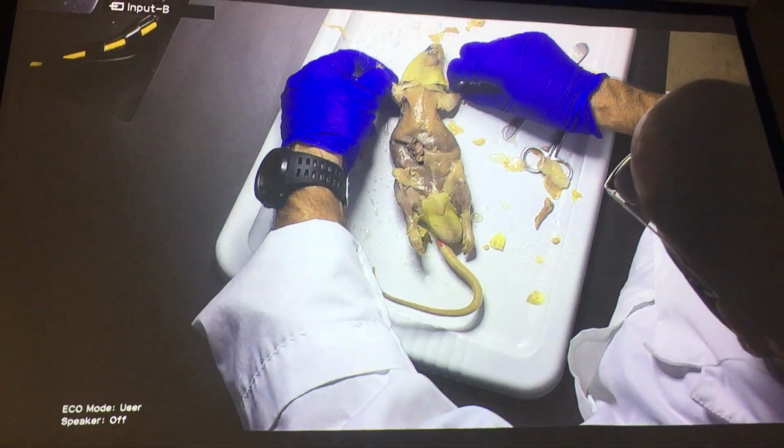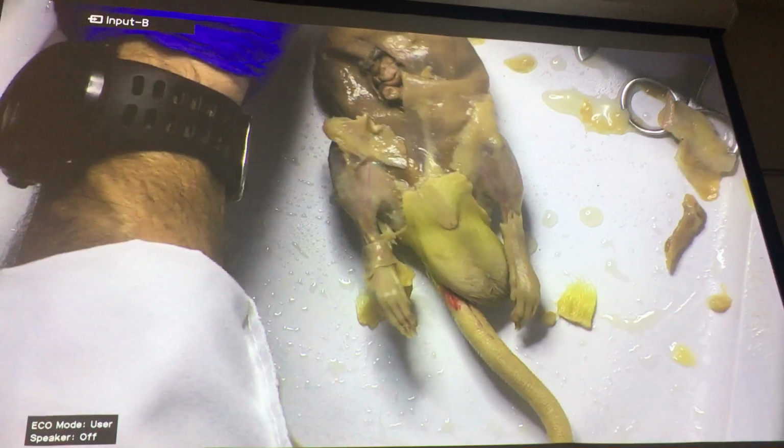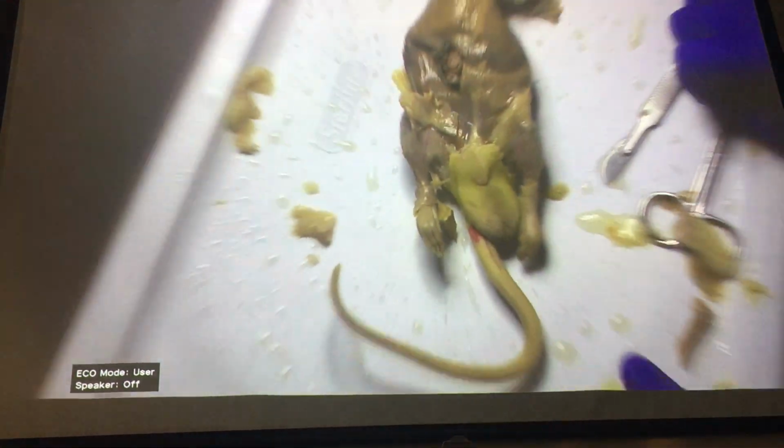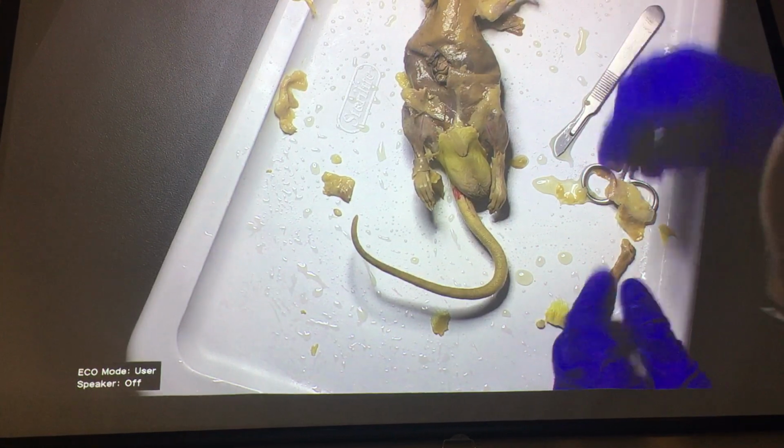Bring those arms down so you get room towards weight. Let those arms start to relax. All right, so working on the medial aspect of the thigh.